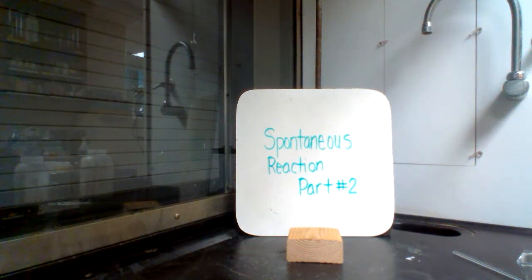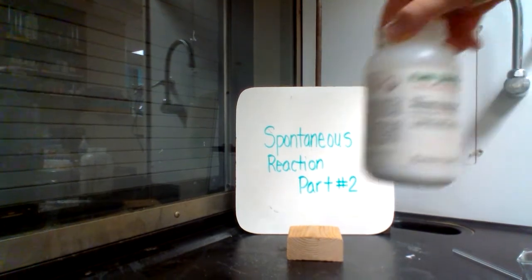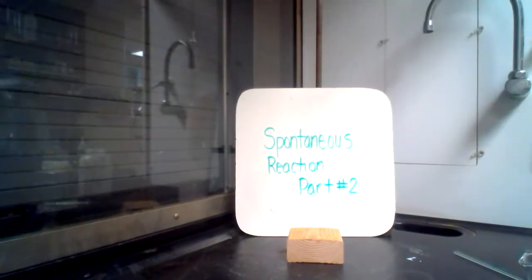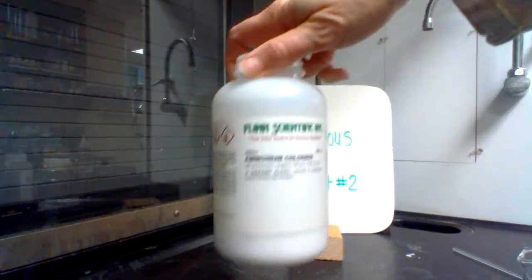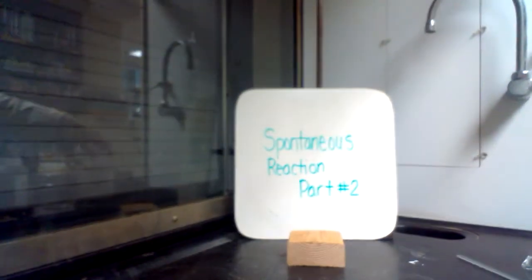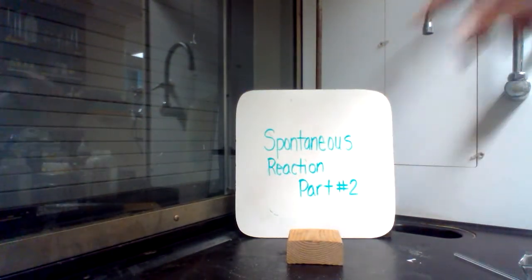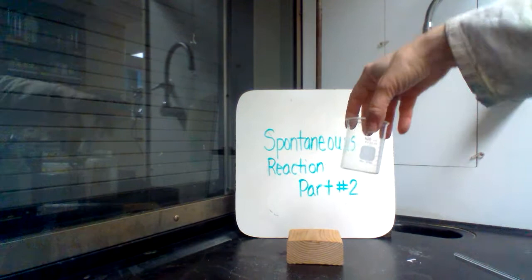For this spontaneous reaction part two, we will do a reaction that we have seen before. I'm going to use barium hydroxide and some ammonium chloride. I have a wooden block and a small beaker.